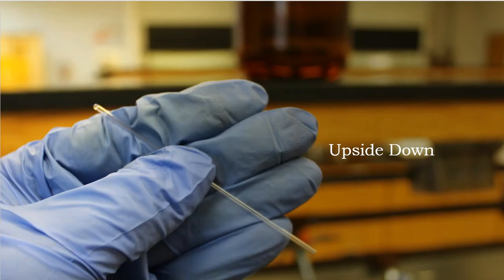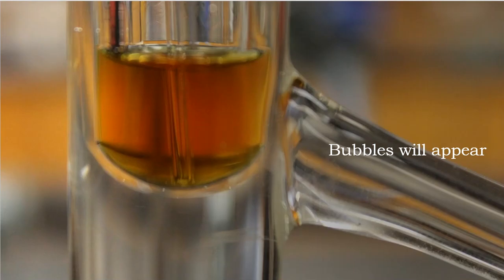Then I'm going to take a capillary tube. You remember one of these capillary tubes that we use for melting points, right? I'm going to turn it upside down, which means the open end is going to point down and the closed end will point straight up. And I'm going to just place that into the test tube that has my liquid.